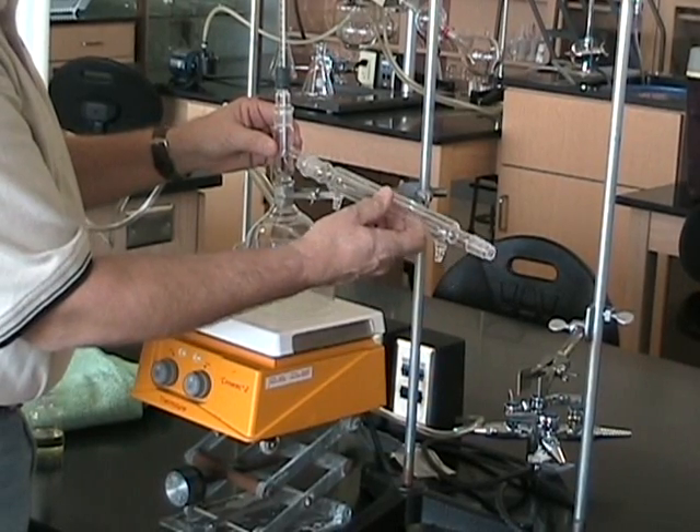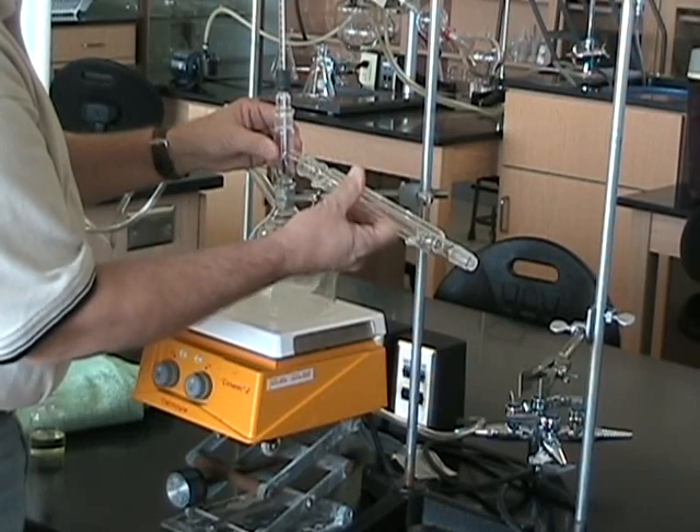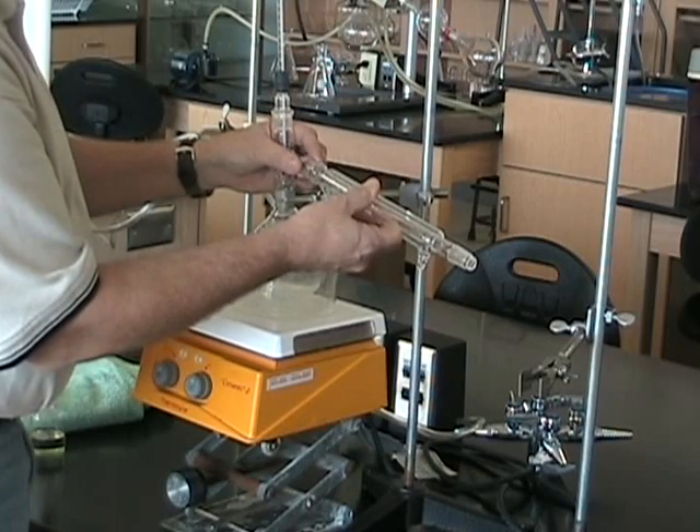Ready to go on the condenser? Turn it in. We have a good clear seal. We have success.